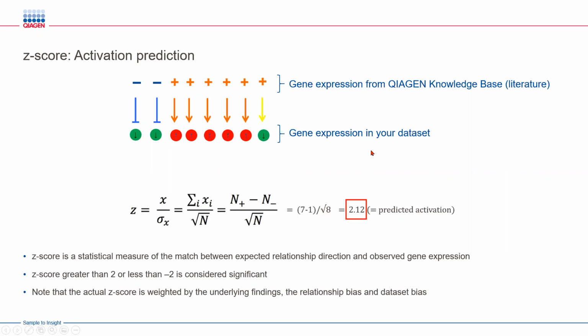So the higher the z-scores, if the z-score is 2 and above, it means it is highly significant. If it is -2 or below, it is considered significant as well. So anything in between +2 and -2 is typically not considered significant. But depending on how your analysis was run and what pathways showed up, you can interpret the data in a slightly different manner. But these are the typical numbers that you should be following, 2 and -2, to make sure your pathways are either significant or not.